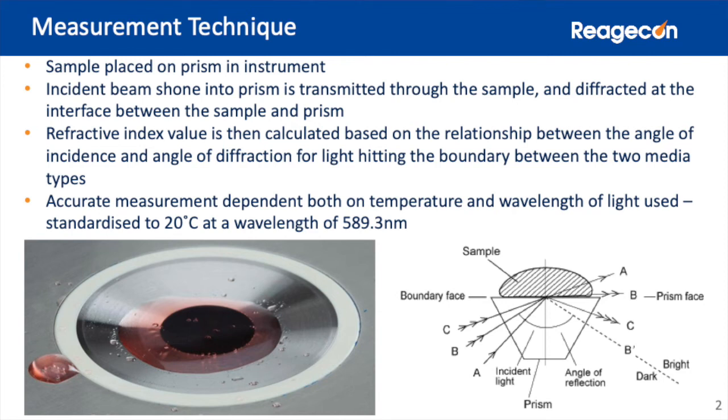The Brix value correlates to the sugar concentration in the sample measured and is expressed as the number of grams of sucrose in 100 grams of sucrose/water solution. The relationship between the refractive index and Brix is determined by the International Commission for Uniform Methods of Sugar Analysis, ICUMSA. Samples that have multiple ingredients, such as salts and sugars, such as liquid sauces like soy sauce, can be measured for total percentage concentration of these substances by using refractive index. The value can be expressed as Brix or refractive index, and the Brix value can be read and interpreted as the total concentration of dissolved materials in the sample.